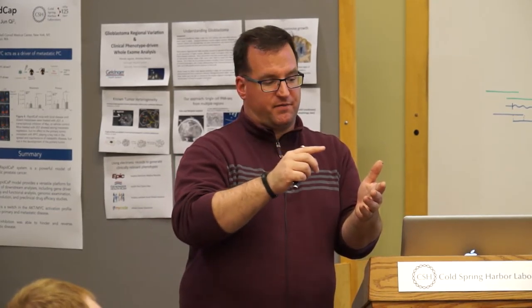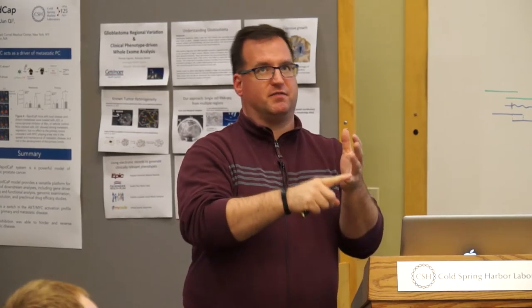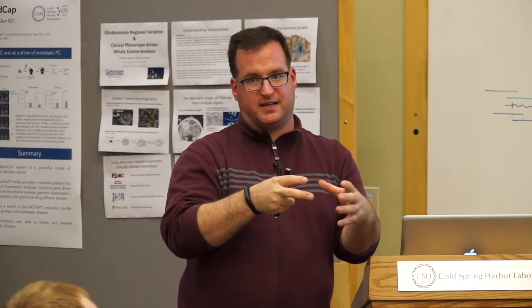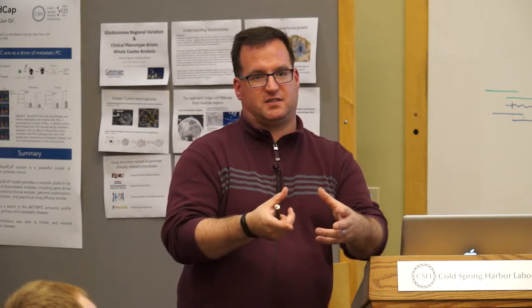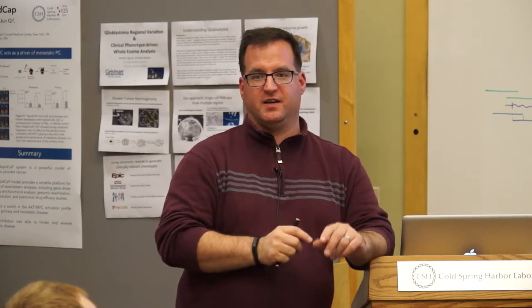So now that means that there's no microscope, and that's for Helicos, for Illumina, for 454, for PacBio. That is the thing that makes the equipment expensive. It's the fluidics, and it's the microscope, and it's the housing, and it's making that thing all work together and stay stable and robust. So without a microscope, the machine is just silicon wafers, right? So all of the computer chip manufacturing industry, all of the advances in nanoscale fabrication, can be brought to bear on this technology.